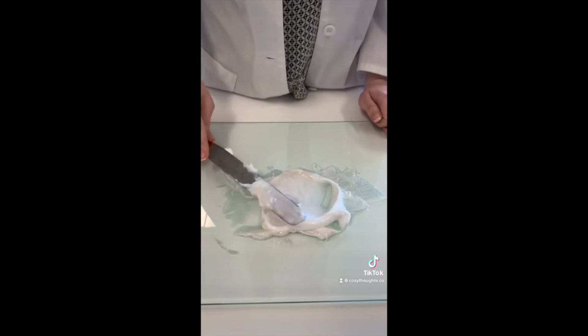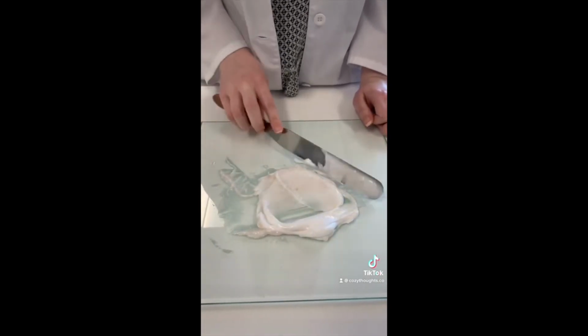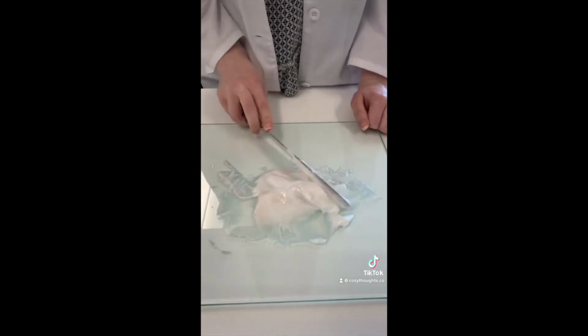And we want this to look like a uniform cream. So we don't want it to look like white with specks of pink. We want it to just look a light pink.